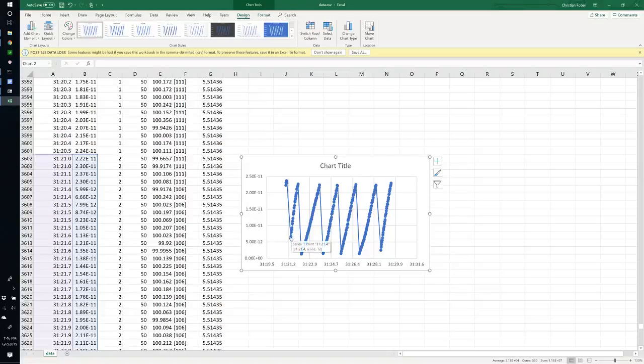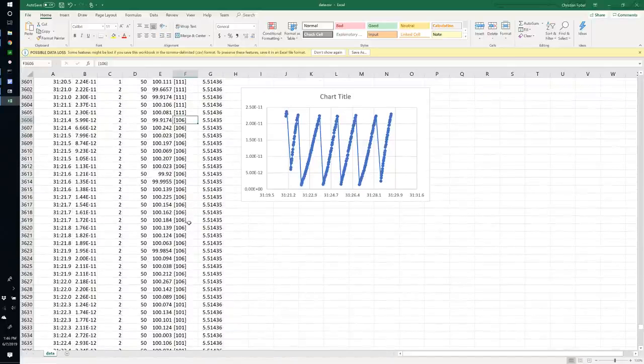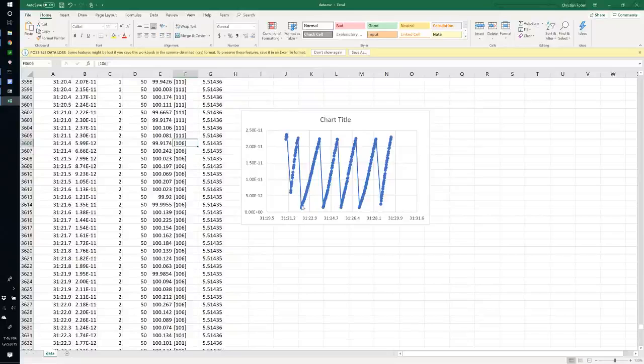So this shows for each actuation on the second step, this is when we've got electrode 111 turned on. It was mostly covered when we started. Then we turn on electrode 106. We see the capacitance goes up until we've reached our threshold, at which point we turn on the next electrode, and that electrode isn't covered by liquid, so the capacitance is low.